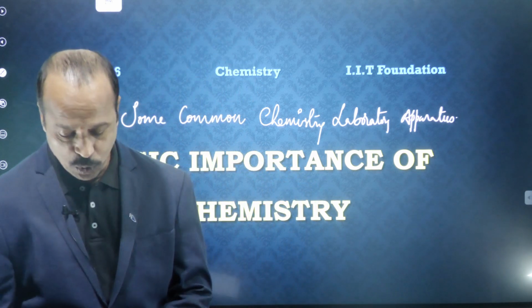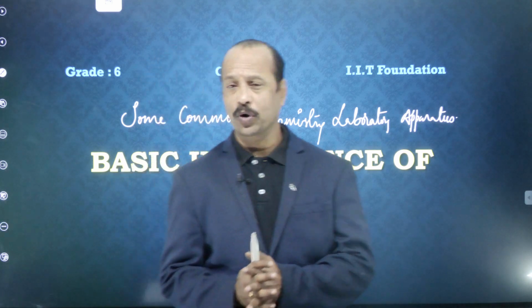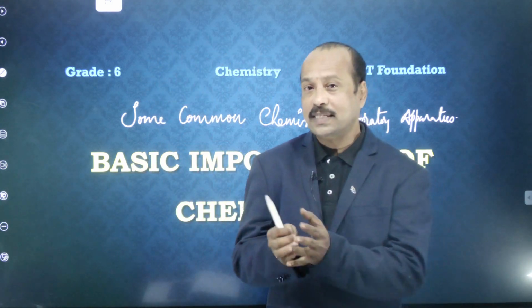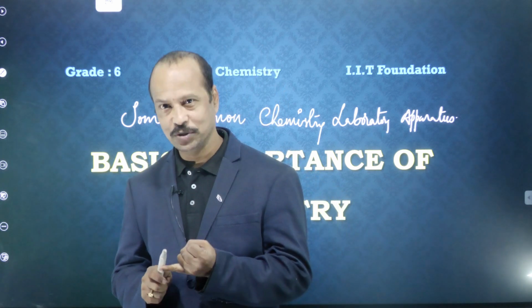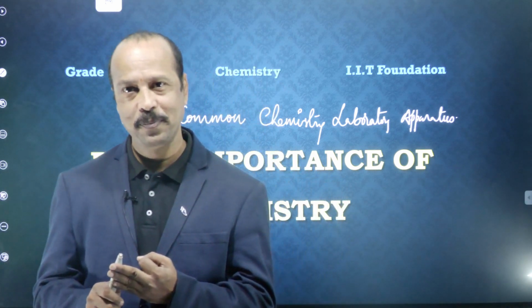Did you visit your school lab? Yes, very good. In the lab, what do you find? Just tell a few names. What do you see in your chemistry lab? Test tube, yeah, very good. Test tube holder, very good. Funnel, good.